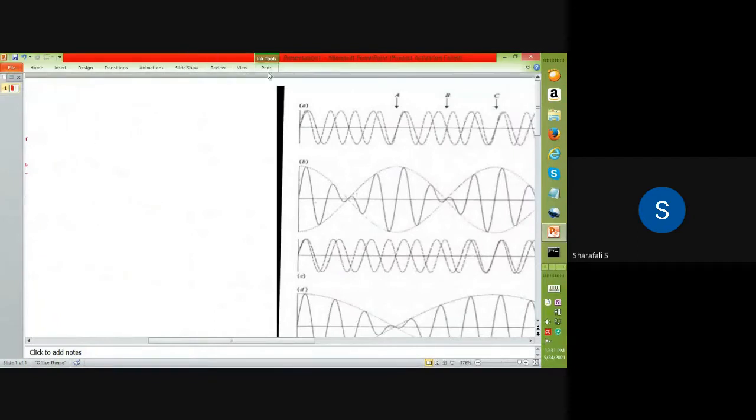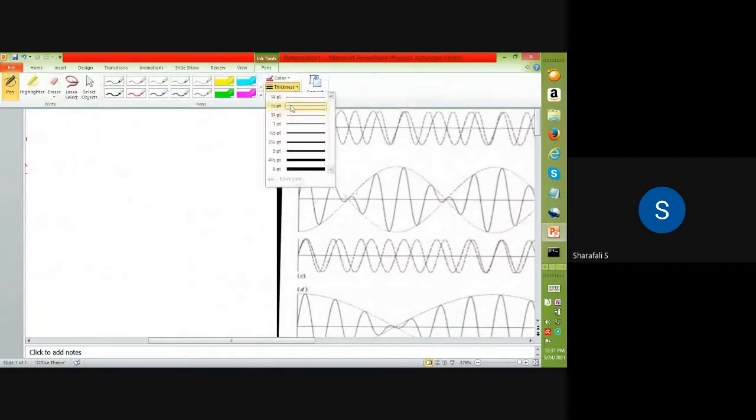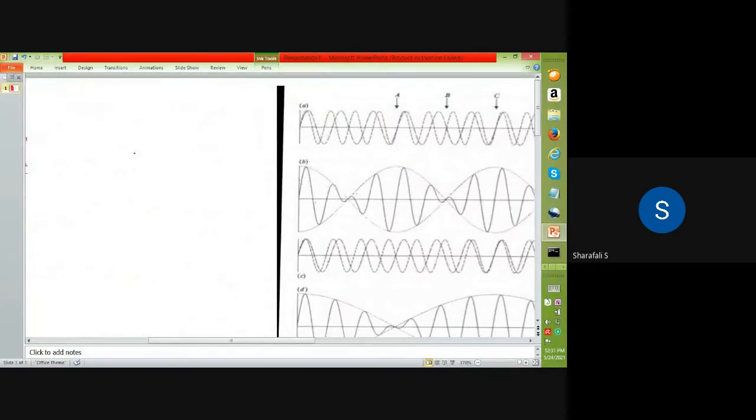So why we need this FTIR technique, or Fourier transform technique, spectrometer, is that we have to consider the grating pair or that prism technique. So the prism has to be rotated to get the different frequencies falling onto your mirror. So depending on the prism's resolution, we have the number of different frequency components that is coming out from that prism. And by using grating, we can have a large number of frequencies as compared to the prism, and the resolving power is high in that case.